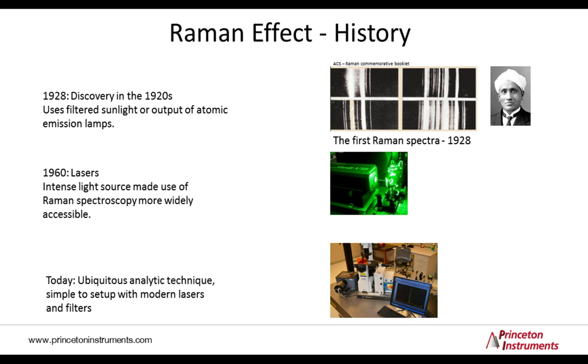Nevertheless, the use of the technique in physics and in particular chemistry was quickly recognized, and Raman spectroscopy became widely established quickly. However, only experts were able to handle the sensitive experiments that were needed to discover the weak signals.